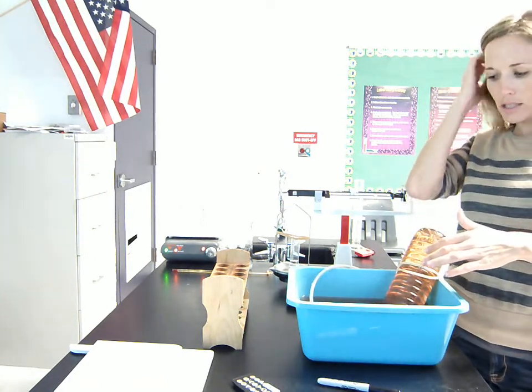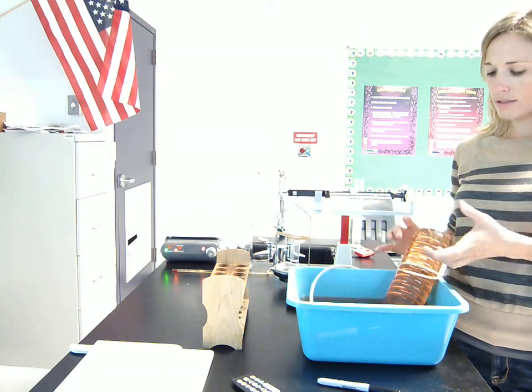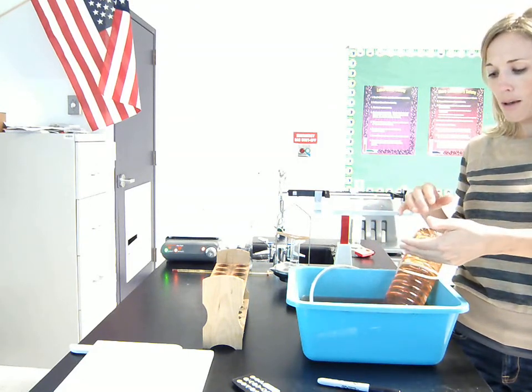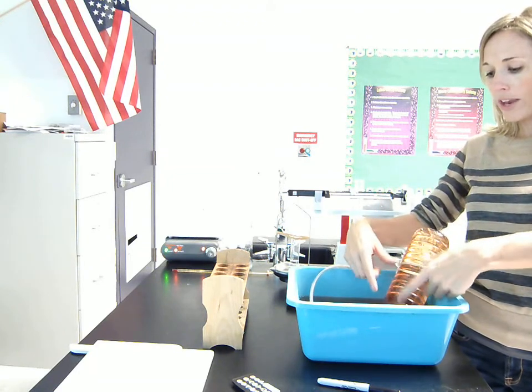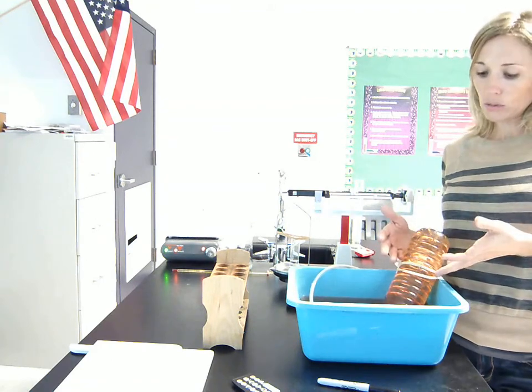Now, once the gas is created and transferred to the bottle, it's going to push some of this water out. So we're not going to have a full 1,050 cubic centimeters of water when we're done. We'll have a certain amount of gas in the bottle. We'll then remove the bottle from the tub, keeping our hand over it so none of the water gets out, and we're going to measure how much water is left over. So if I know how much I'm starting with, and then how much is left over, I can subtract those two to figure out the volume of the gas that we just produced. So that's how we're going to do the volume part.